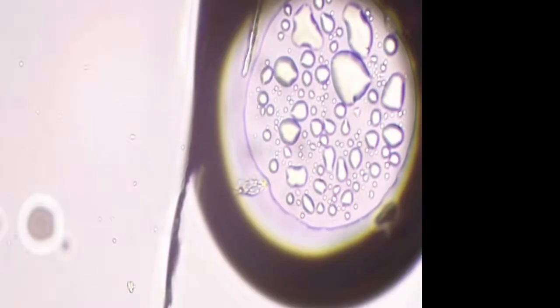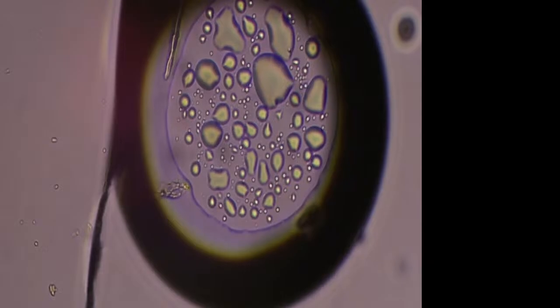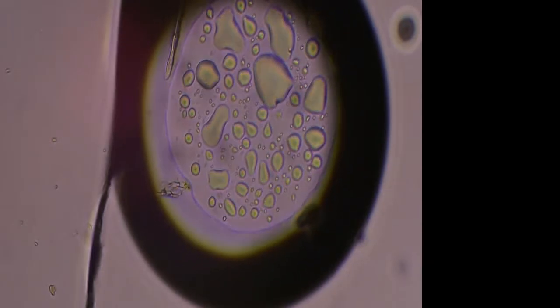And just so you can see what it normally looks like, this is in oblique lighting, so this is the typical look you'd have in a white light standard view.